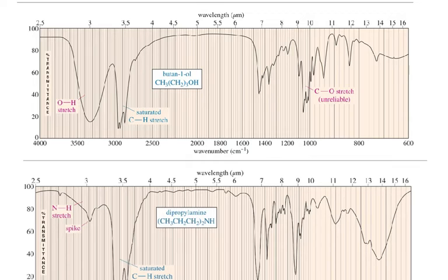But if I've taken a spectrum of a new chemical that I found in nature from a rare beetle that spits out venom, and I put it in an infrared spectrometer to try to see what it is, and I don't have a comparison spectrum, that fingerprint region all of a sudden means nothing, because there's so much noise in it that we're not going to see any distinctive signals for a functional group. The rest of the spectrum, however, is useful to us. For example, the thing labeled OH stretch around 3300 tells us there's a hydroxyl group, and then we know that about this compound.